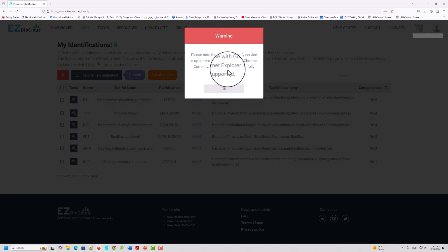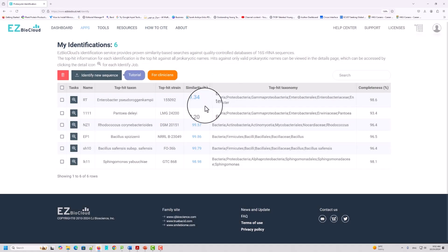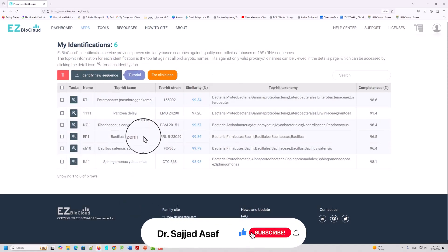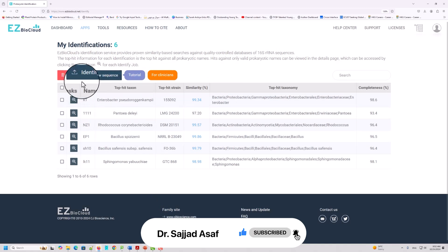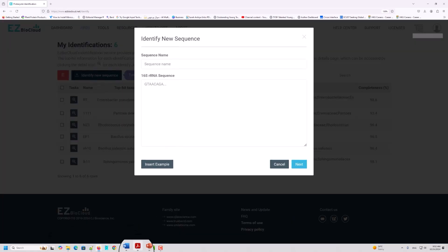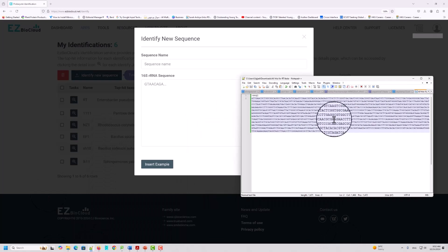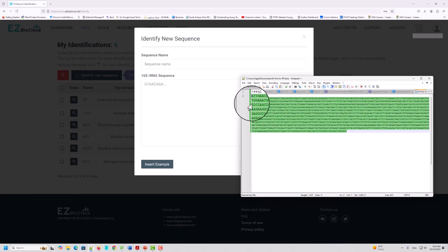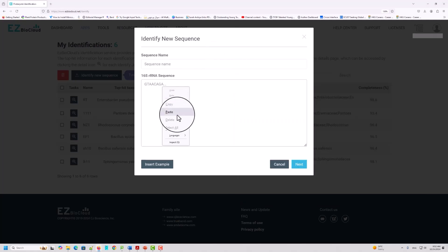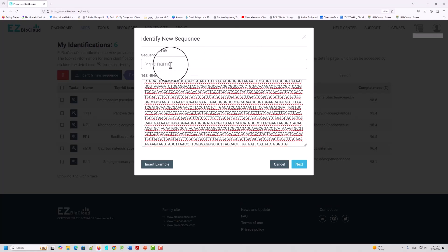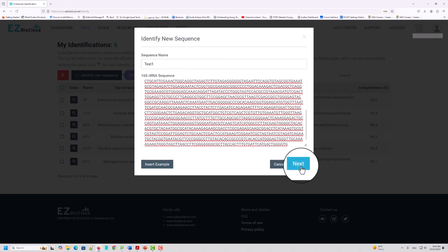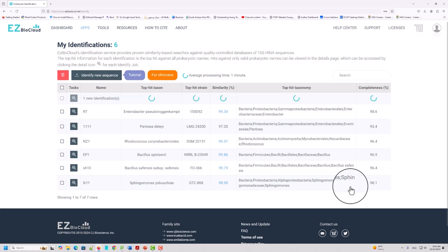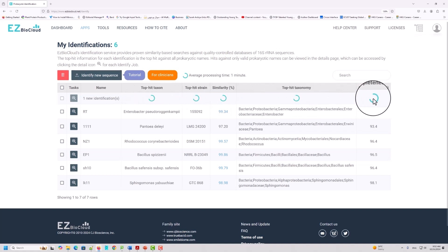When you click the 16S-based ID tool, you will see your previously submitted sequences. Click 'Identify New Sequence.' When I click this, it opens a submission form. I will go to my sequence, copy it, and paste it here. Then I will give a name to this sequence — for example, 'Test 1' — and then click Next and Submit.